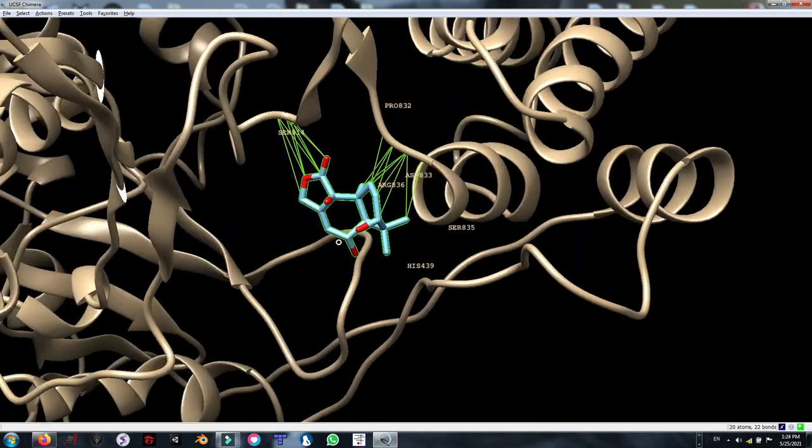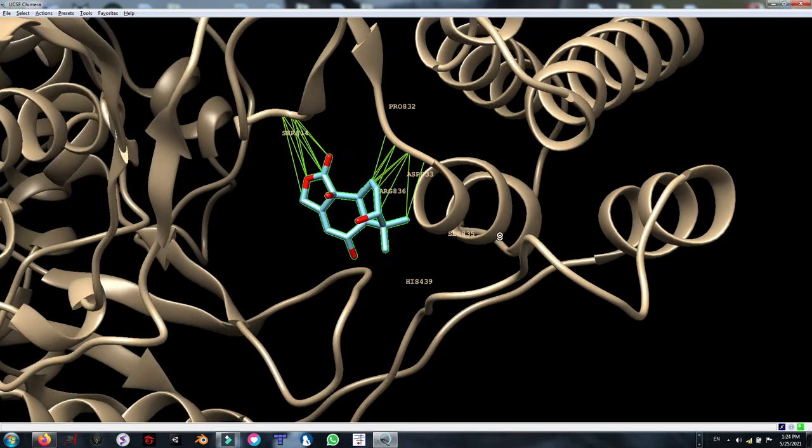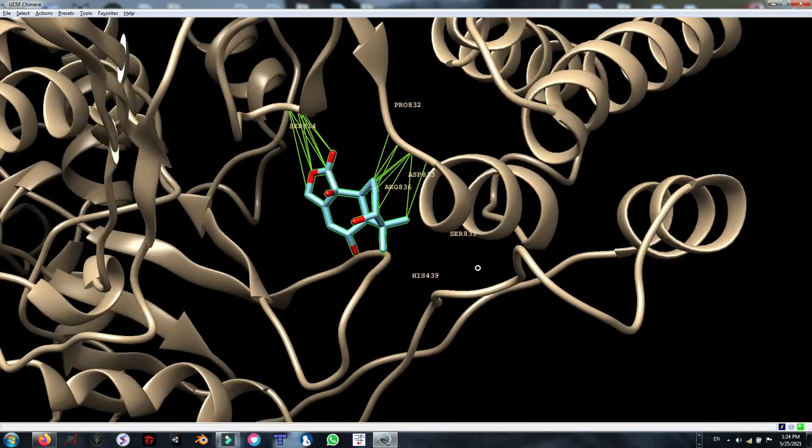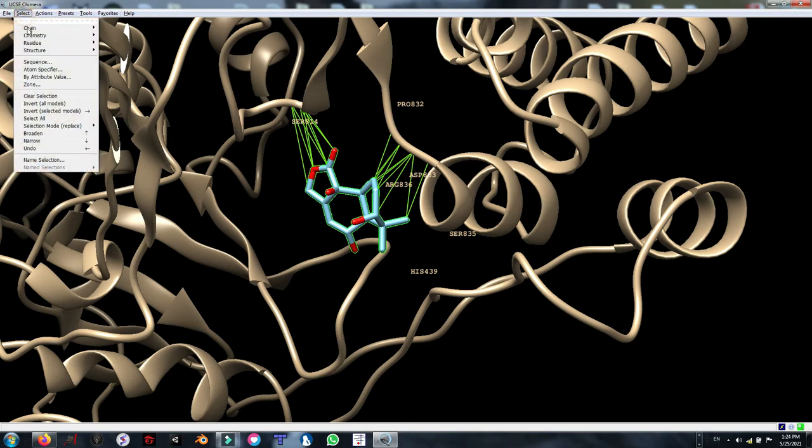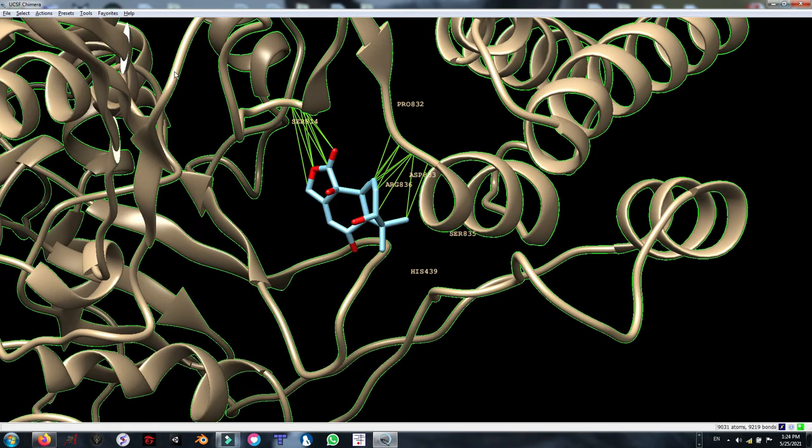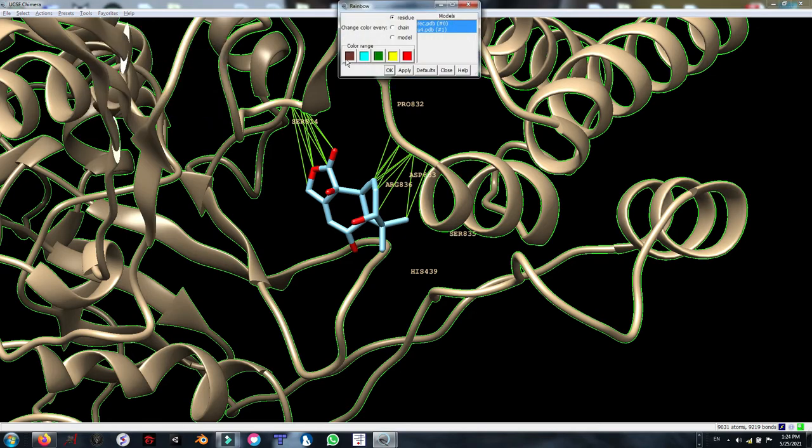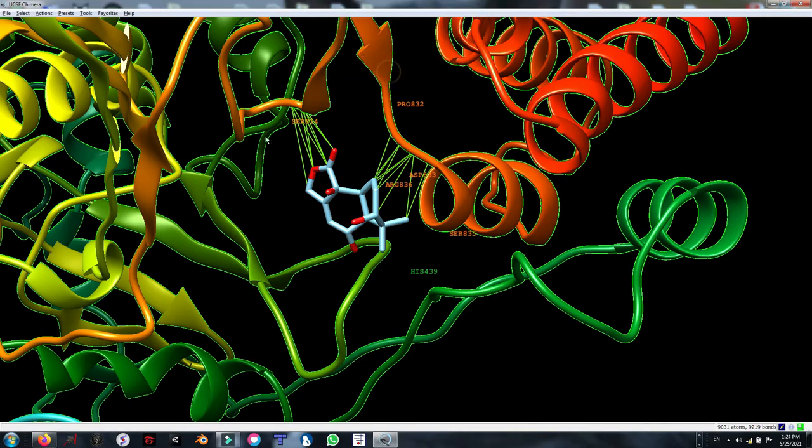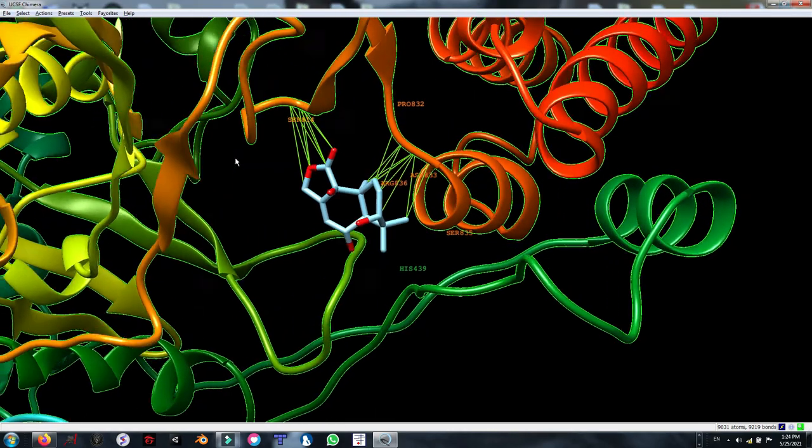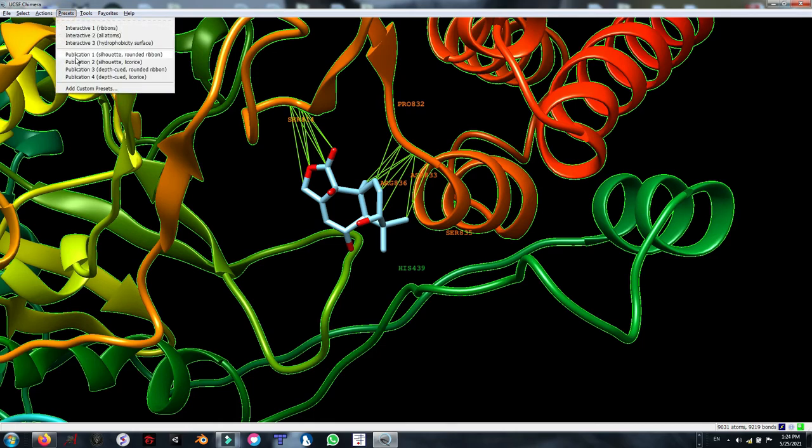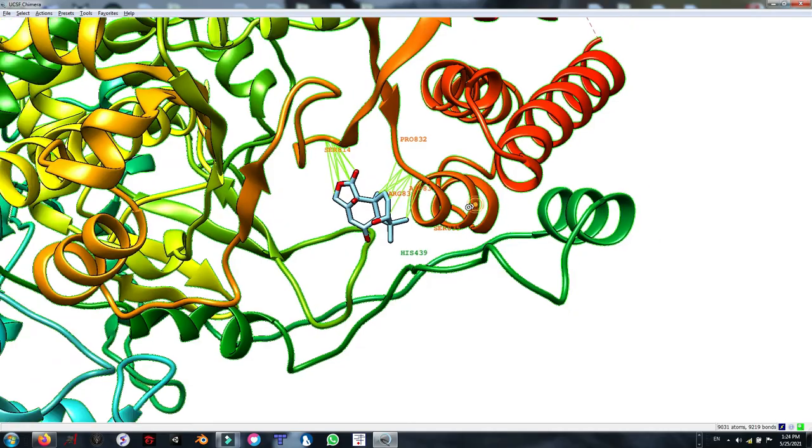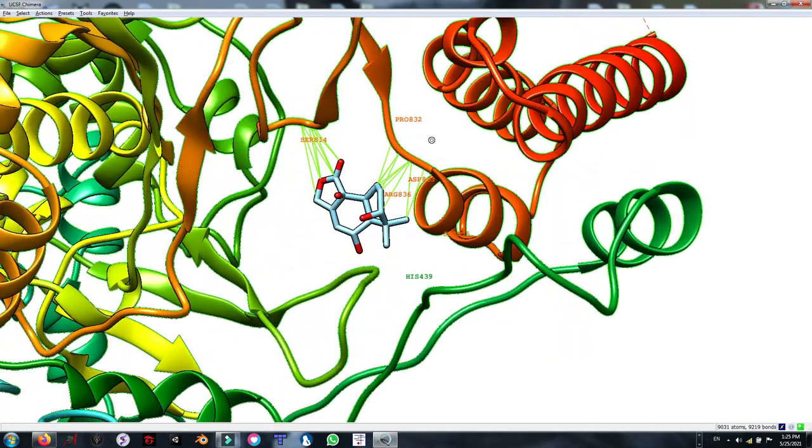Now for demonstrating or taking pictures of this view, I am going to do some modifications in the UCSF Chimera software. At first, I am going to select chain, the receptor, and I am going to change its color to rainbow. I am going to use the default. As you can see, the background is in black, which is not good. I am going to use presets within the software. Preset 1. That's not bad.